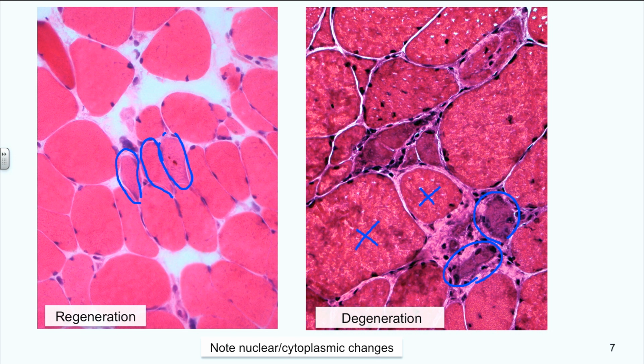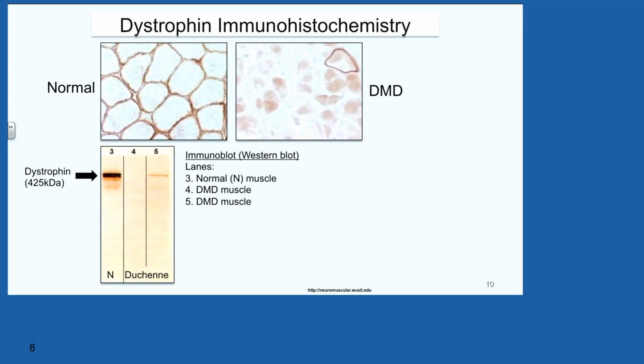So by looking at standard morphology again, we can have an idea about the degeneration and the regenerative capacity. And then when we use our hydrolytic enzymes of alkaline and acid phosphatase, we can confirm and also have an idea about the intensity of the turnover in the muscle.